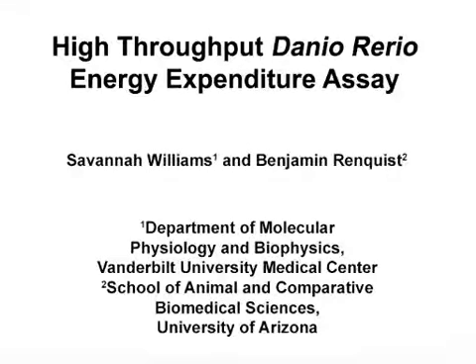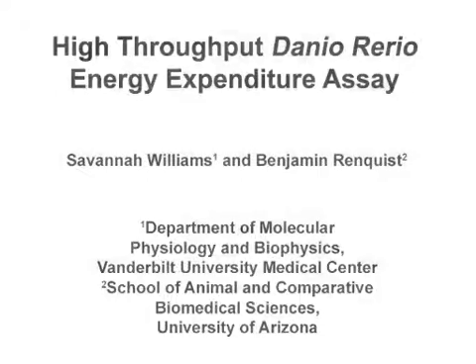The overall goal of this high-throughput resazurin-based fluorometric assay is to monitor the effect of genetic or pharmacological manipulations on NADH2 production, which is a measure of metabolic rate. This method can help us answer key questions in the obesity field, such as the effect of a given drug or gene on metabolic rate.